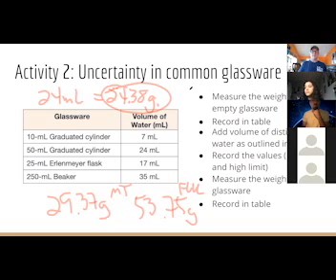One thing I want to point out to you: if you look on the top, so look at the very top of the graduated cylinder. You'll see some writing. It's kind of hard to see over the screen, but it'll say who made it, ESCO, I think, or something. And then it'll say 10, or 10 colon 0.2. So it tells you the volume of it and what each check mark is, what the measurements are. And then below it, it says TC, TD, 20 degrees C.